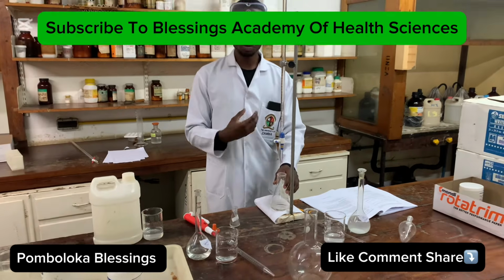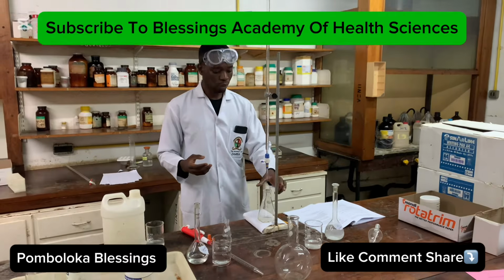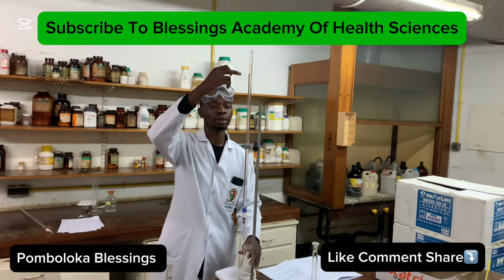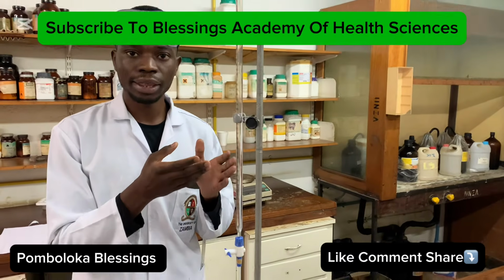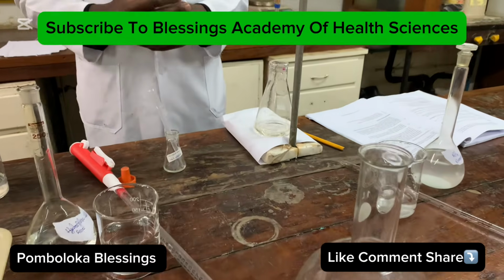So now we're going to titrate the HCl with the sodium hydroxide. Now I'm going to do the first part of titrating. Okay, so I'm starting from 0 here. What we have in the burette here is the titrant, which is the sodium hydroxide. And what we have here in the conical flask is the HCl.